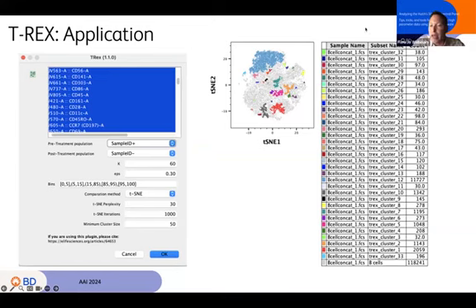You can see that we get 33 clusters pop up. Some are fairly small. And I've overlaid them just on the overall T-SNE map to show where they are. So there's this large population here and a couple smaller ones scattered throughout. And so that is the differences in B cells between one patient and the next.